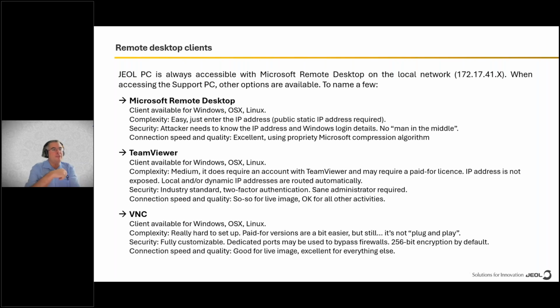Right, so in order to get to the Jeol PC, we will be using the Microsoft Remote Desktop client provided by Microsoft. This is something that the Jeol PC supports. So once we log into the support PC, we can then use Microsoft Remote Desktop to log into the Jeol PC. So you see how the support PC works as the man in the middle, so to say.